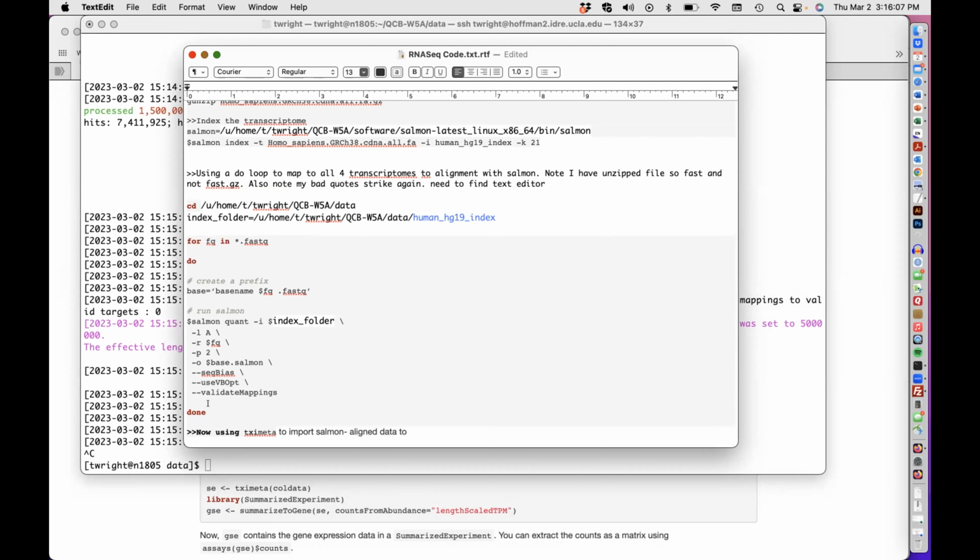So what I would do, just to make sure that you have a single run done here, for this salmon quant right here, that section, instead of $fastq or $FQ, just write out KD1.fastq, all the way down where you run salmon itself.